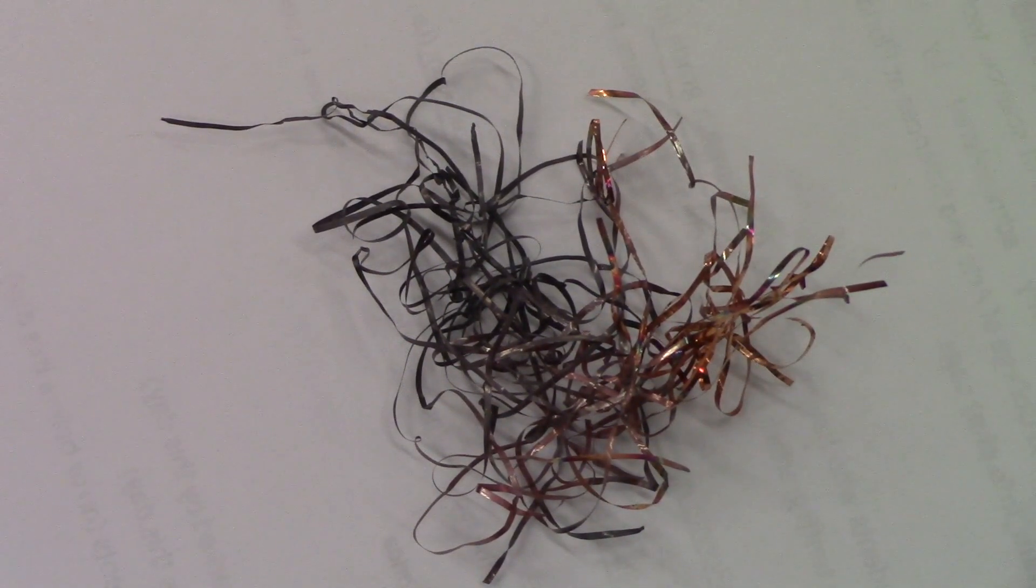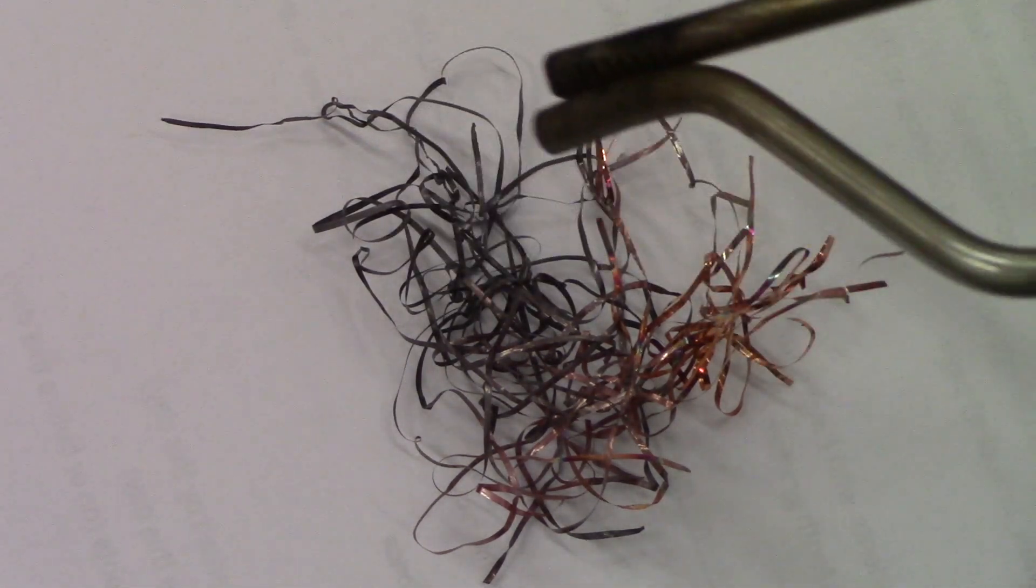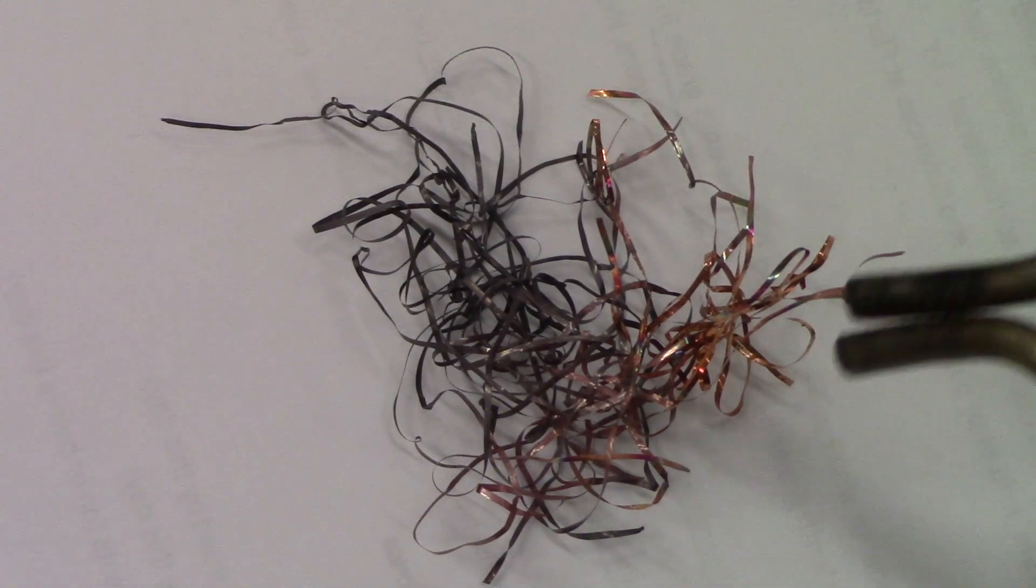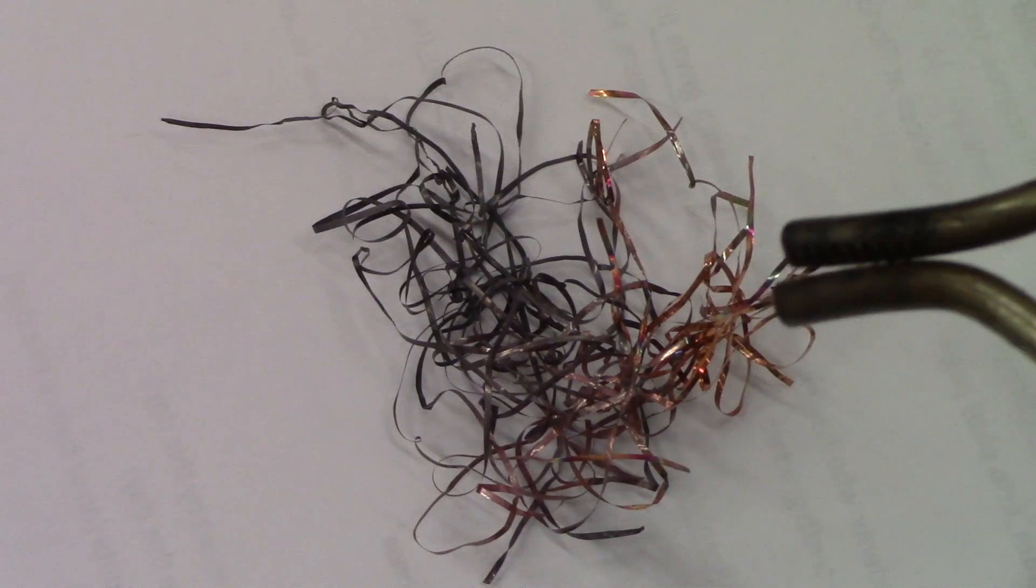Here is our copper after it has been through the flame. You can see over on this side, it's dark grayish, almost getting near black. That's where the copper oxide is formed on the outside of the layer. Over on this side, we still have the bright, shiny, traditional copper color.